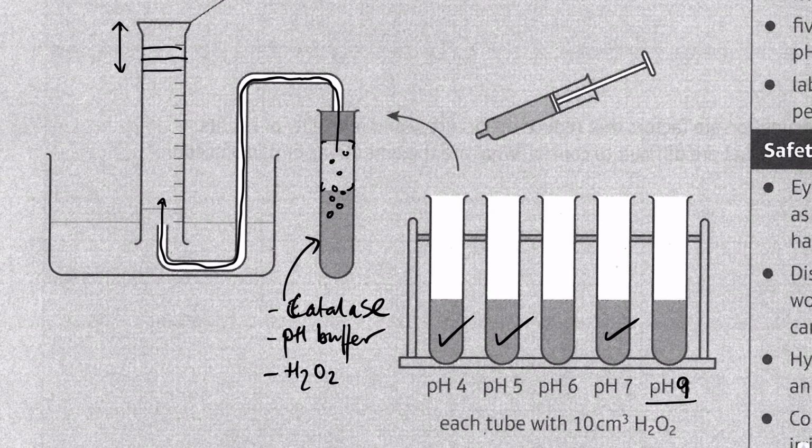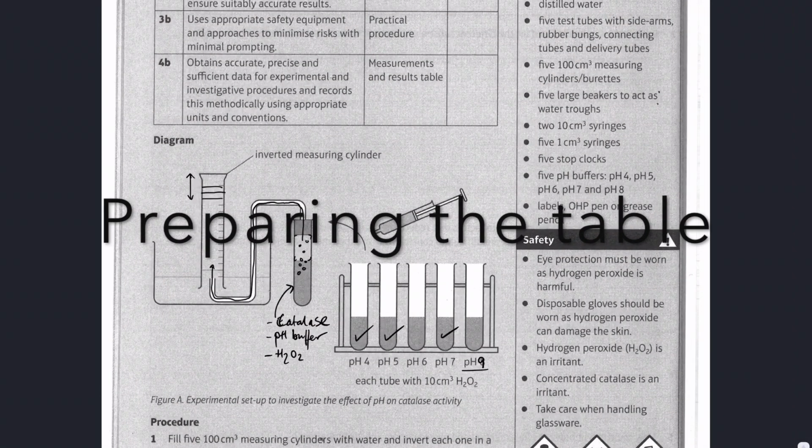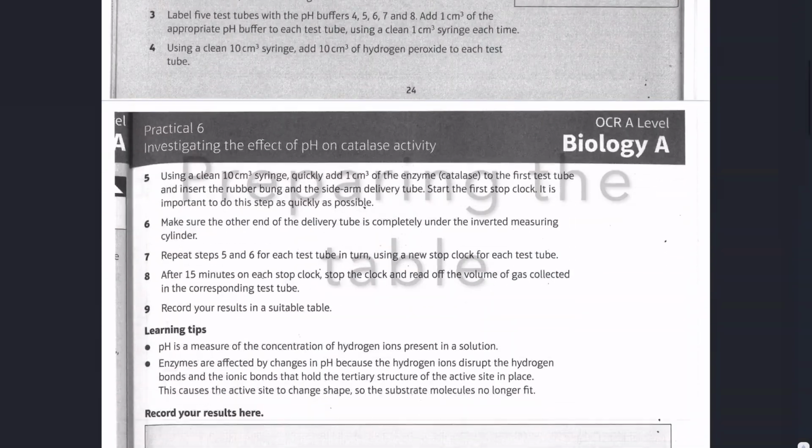And now what I would like you to do is complete the data analysis for that. So I've got a sample set of data. Obviously, your write-up has to be based on your data. However, what you do with that data, I will show you using the data that I have. Okay, so as you were collecting your data, you should have had a table. So I'll just review quickly what that table should have looked like and why it looked that way.